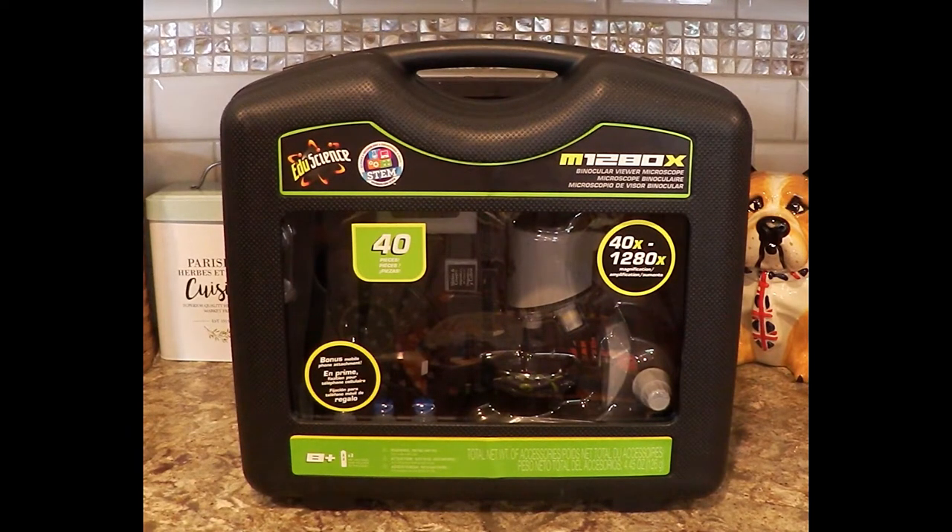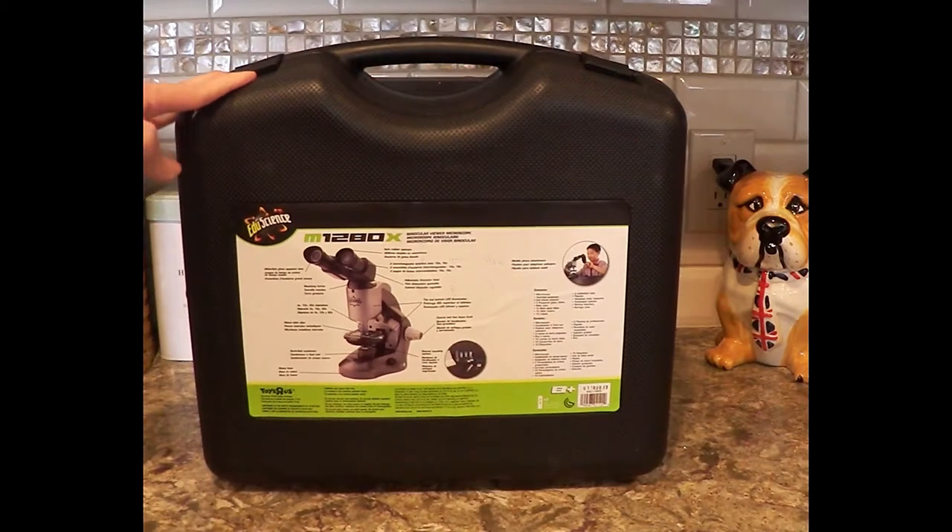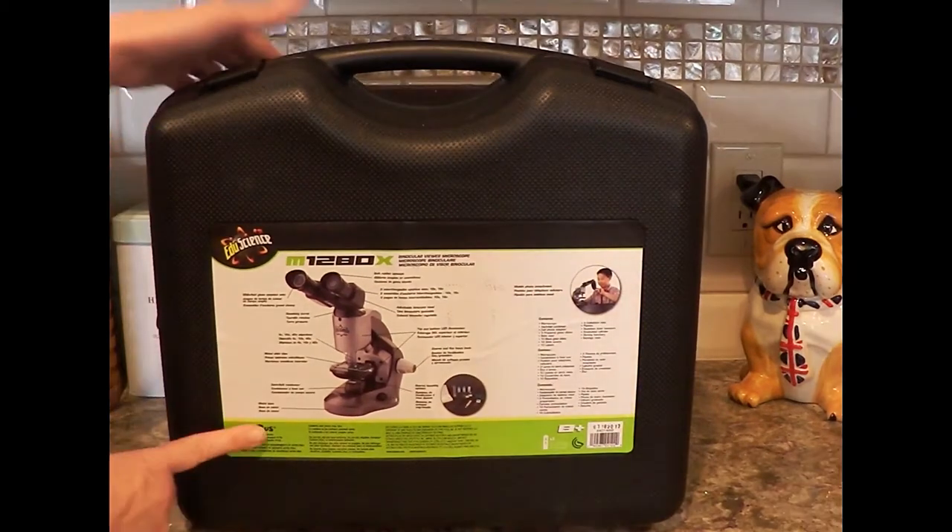Our son is going to benefit from this because he's just getting into science. It comes in a nice case. It's the M1280X by EduScience. It's a Toys R Us exclusive.